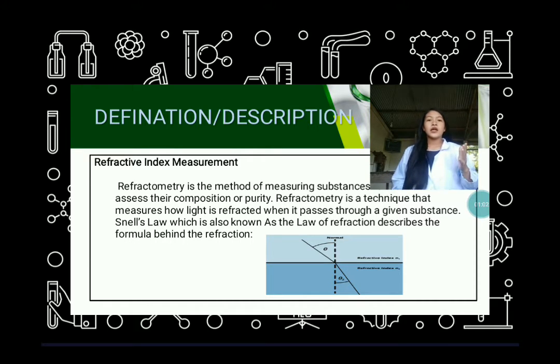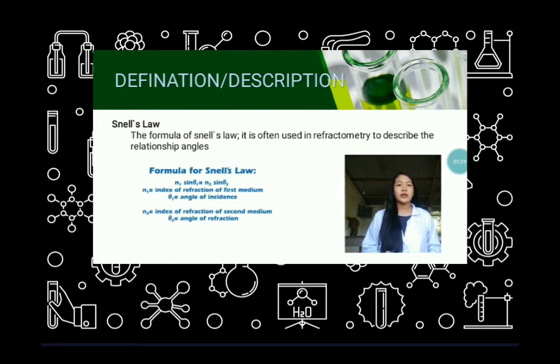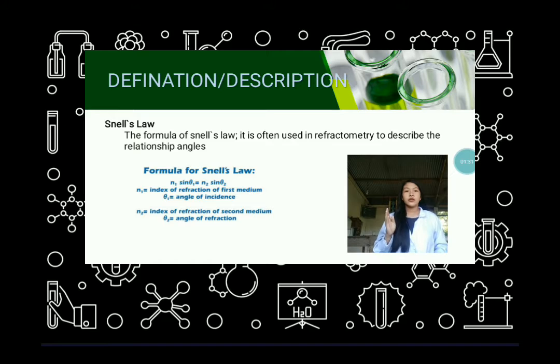For this, they use Snell's law, which is also known as the law of refraction. It describes the formula behind the refraction. The formula of Snell's law, as you can see, is often used in refractometry to describe the relationship between angles.